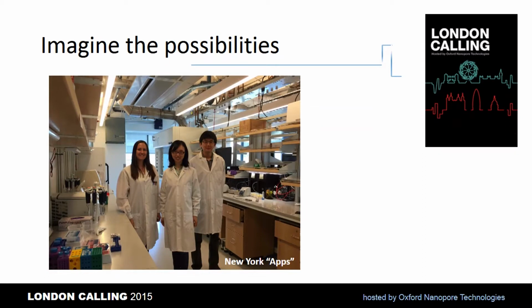Imagine applications such as real-time strain identification, detecting natural base modifications, or wholly artificial unnatural nucleotides. The possibilities are endless. The Applications Group thanks you for listening.